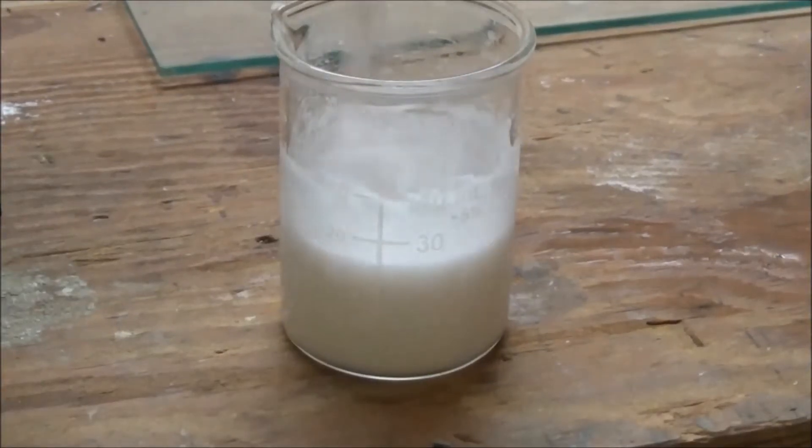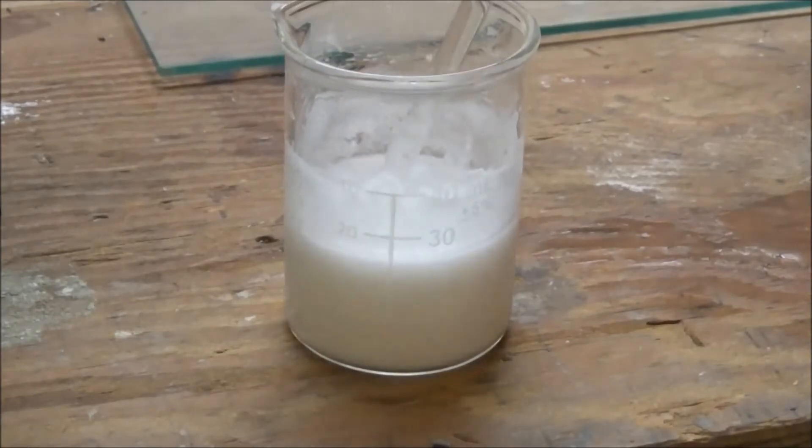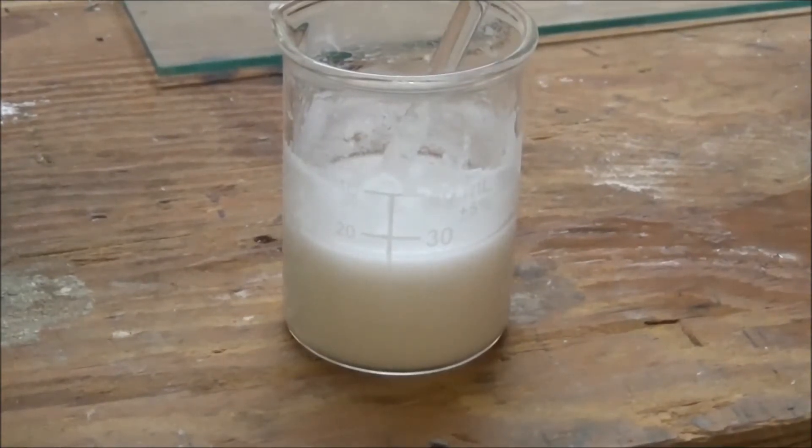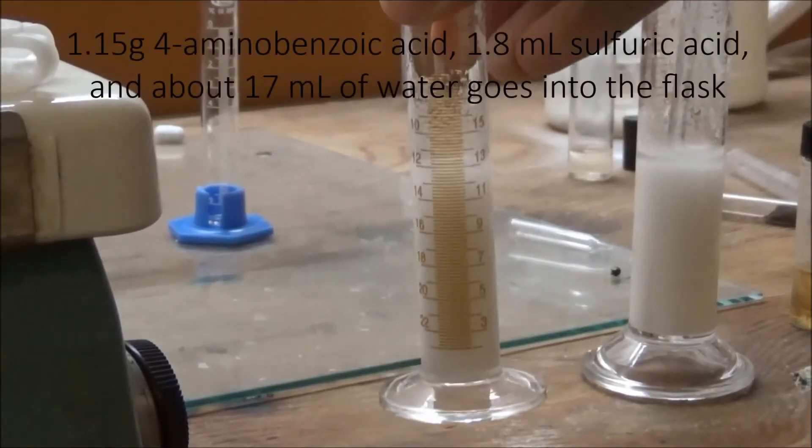With stirring, some water, and ice, I was able to add all of the sulfuric acid and got this suspension you see here. At this point, I decided to reduce my scale to one-third of the original. I mixed it up and measured out one-third of the total volume.